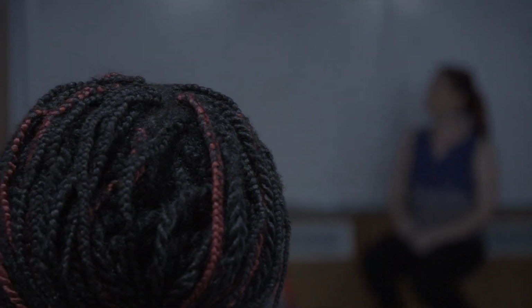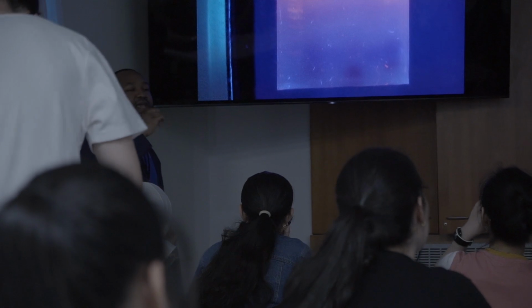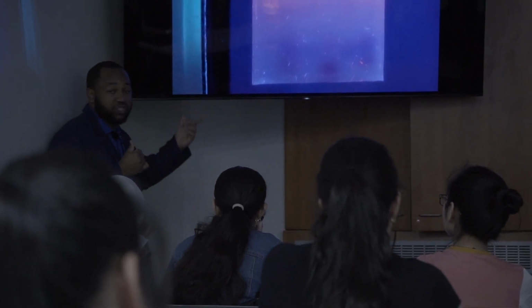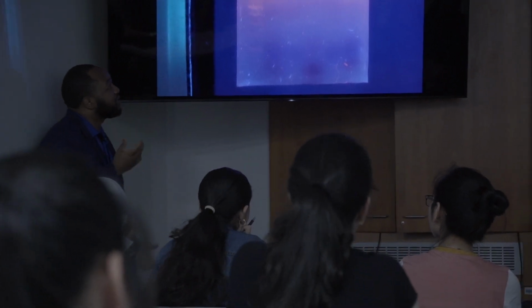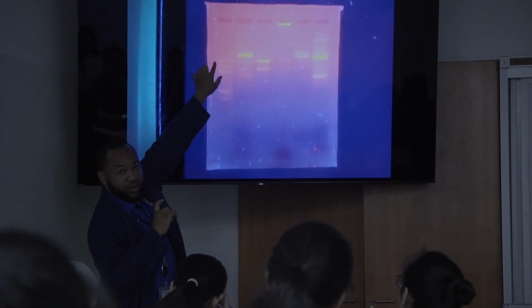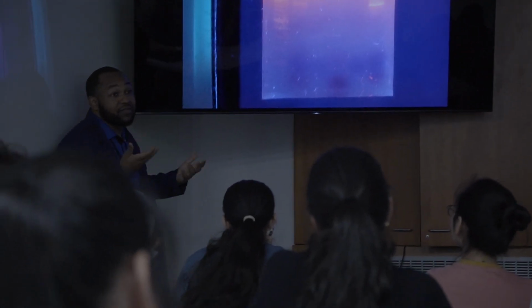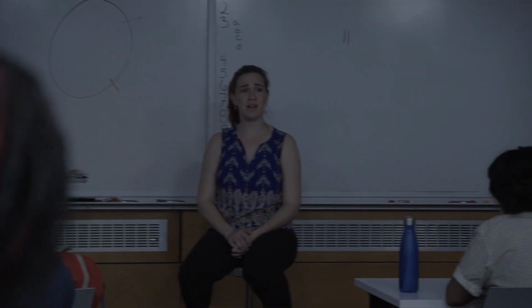And a component of that as well is the number of cycles you run. You can actually do the math to track exponentially how, as the number of cycles increases, the number of ideal fragments you get increases, but we didn't do a PCR for the restriction digest. So if you have a third band on top that is actually higher than your ladder, right? This is the 1500 band on the ladder. Remember that ladder I showed you in the lecture earlier? This is the highest on the ladder, and that's higher than that. So if we see a third band that high above the ladder, chances are some of the plasmid didn't get cut properly. Does anyone have an idea of how the next time we can make sure it all gets cut?